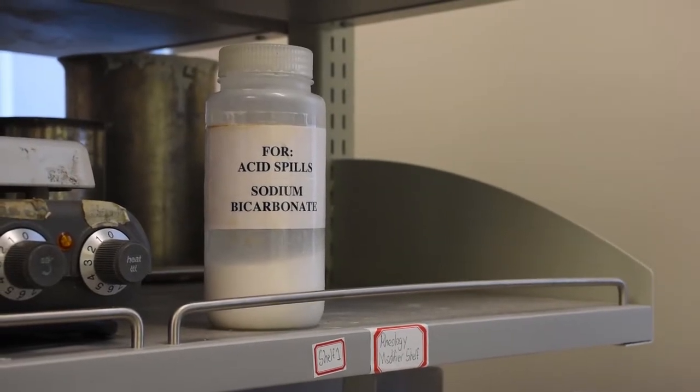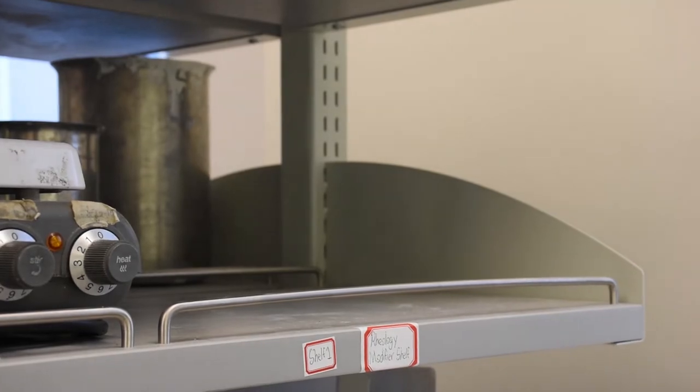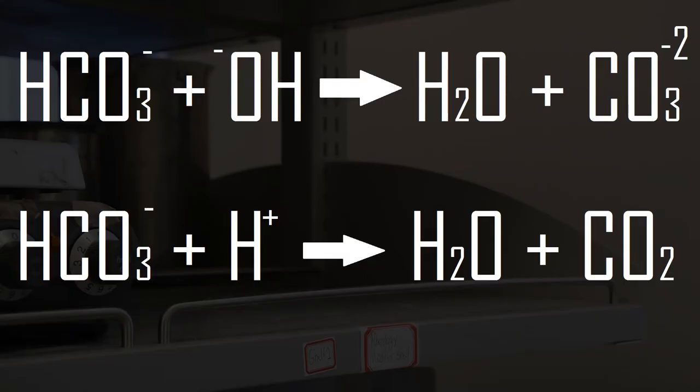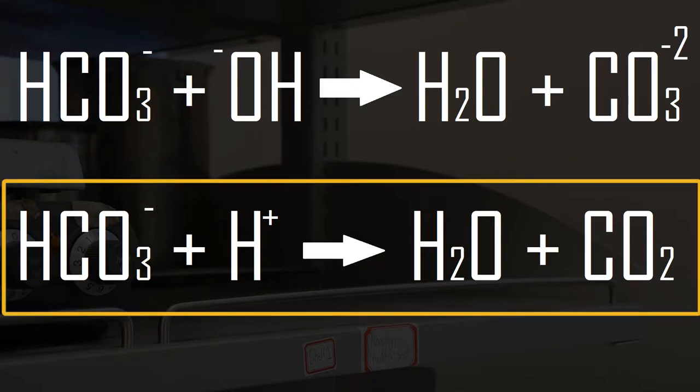Locate sodium bicarbonate. Sodium bicarbonate can be used to neutralize acid or base spills because it's amphoteric. When it reacts with a base, it forms water and carbonate ions. When it reacts with an acid, it forms carbon dioxide and water.